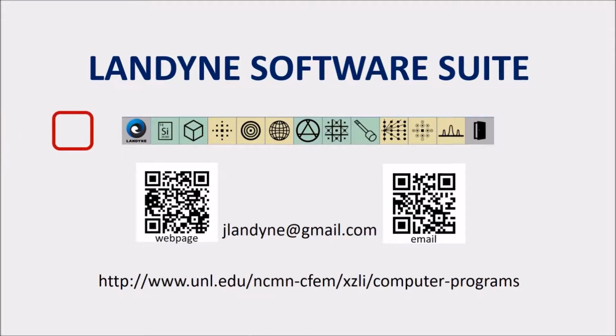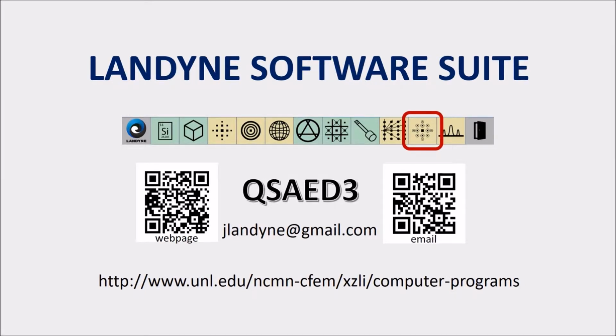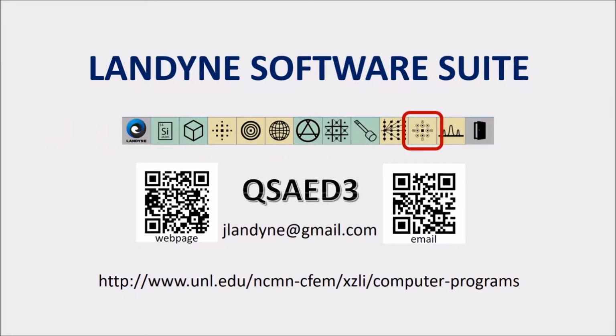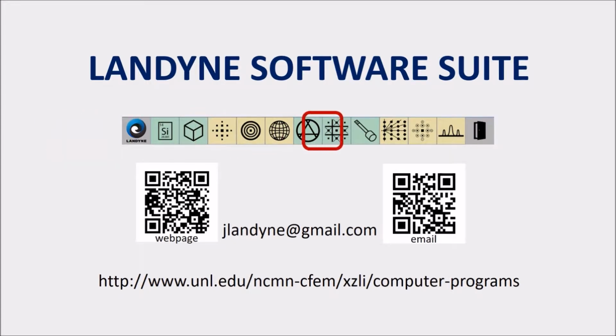In this tutorial, I will introduce QSAED3, a computer software for quantification and processing of SAED patterns. The current version is 3D. This is one of the main components in the Landyne software suite for electron diffraction simulation and crystallography analysis. You may download the software suite from the website on the screen.